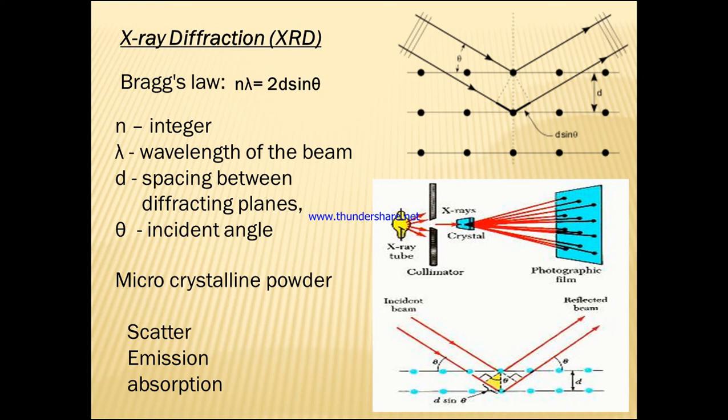In the same way we are having another instrument, we call it the goniometer. So the goniometer we are going to use in X-ray diffraction. This goniometer is one of the instruments which is used to maintain the angle and to rotate. The X-rays are generated by a cathode ray tube, filtered to produce monochromatic radiation, and collimated to concentrate and directed towards the sample here.